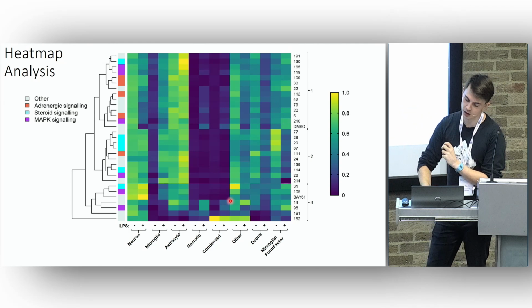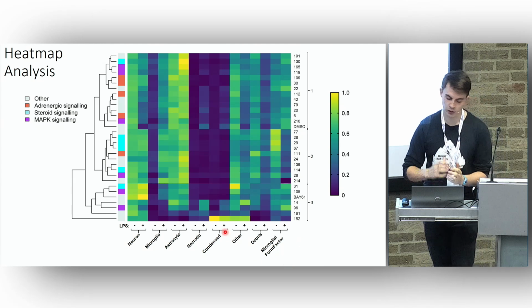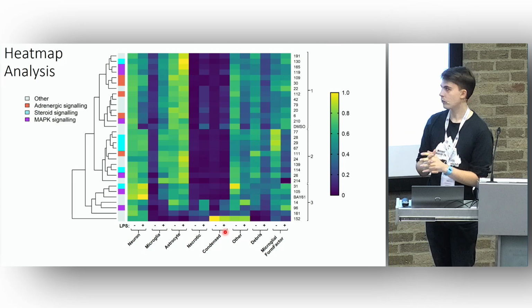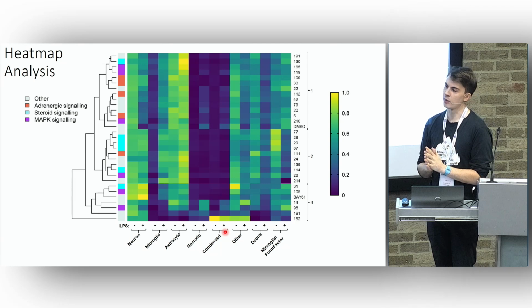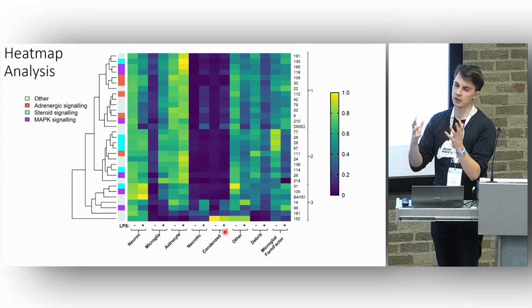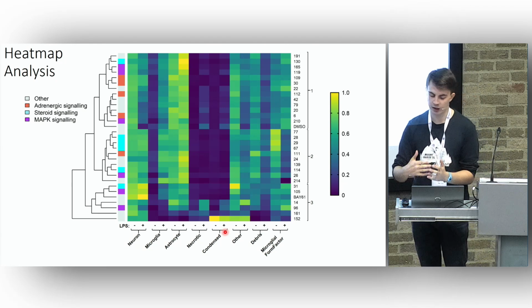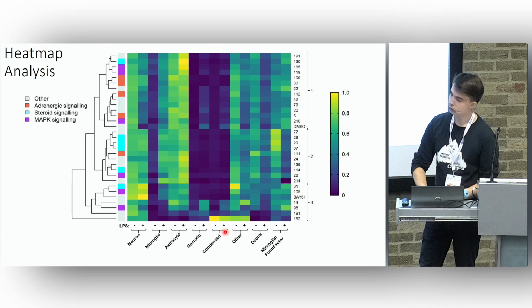So we've got our counts for the different cell types. We've got the morphology in there as well, in the absence and the presence of LPS. And then we try to cluster and find hits that are doing similar things. In a sense, this is now prioritizing and looking at hits. We're not screening, this isn't looking for just neurons up or down. This is really looking for a phenotypic state of the culture as a whole, which is a little bit beyond what most methods would allow you to do.